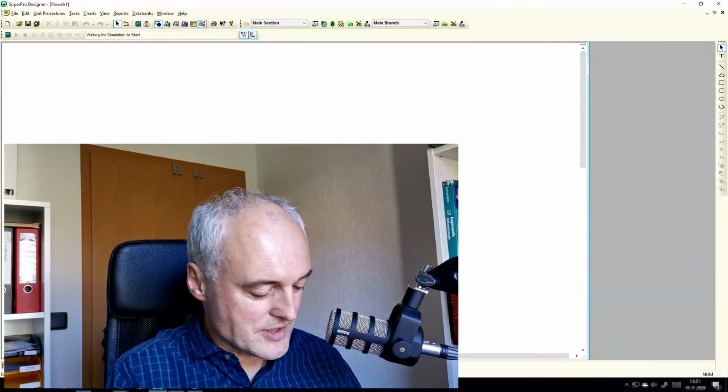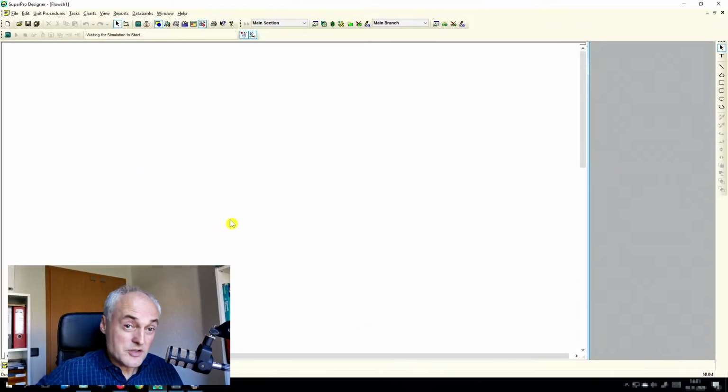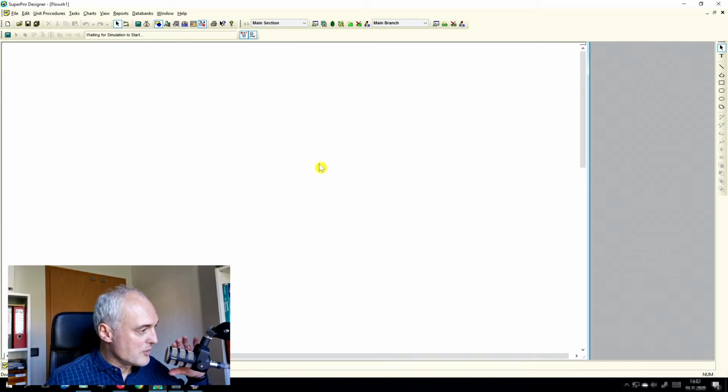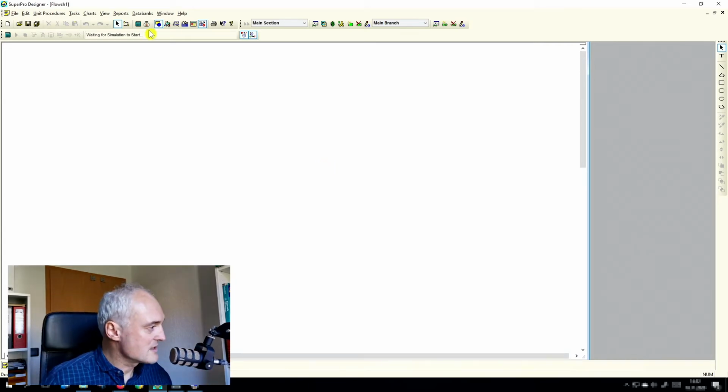So, setting up the process. We want to start a new fermentation procedure. If we want to use a fermentation procedure, what we need is a bioreactor, so we need to put a bioreactor in our process. Before we do that, we need to register our substances. The first step is always registering pure components. I have already started a new batch process as last time, and now I start with registering the substances. So here we go.